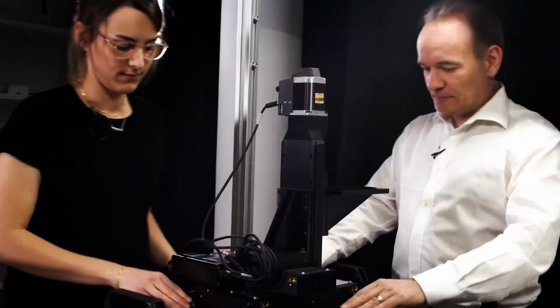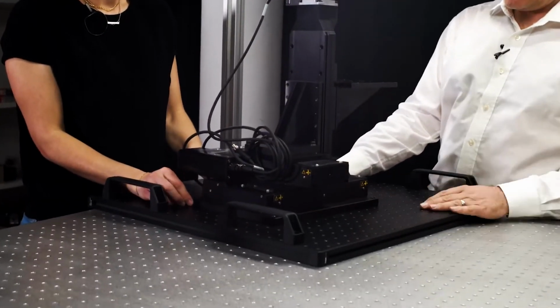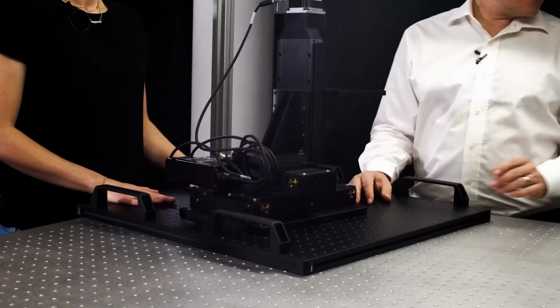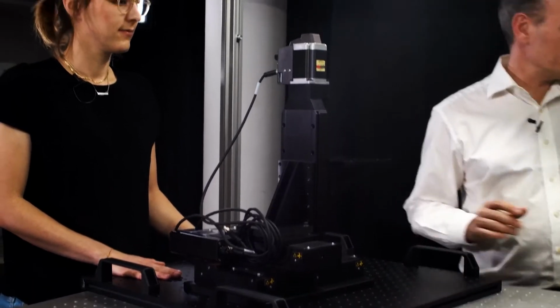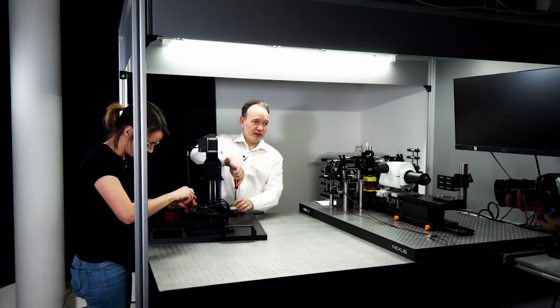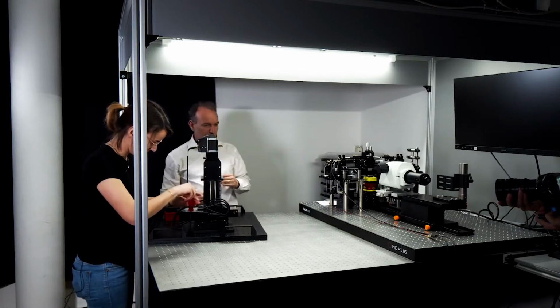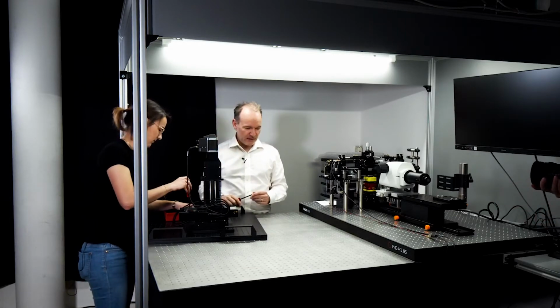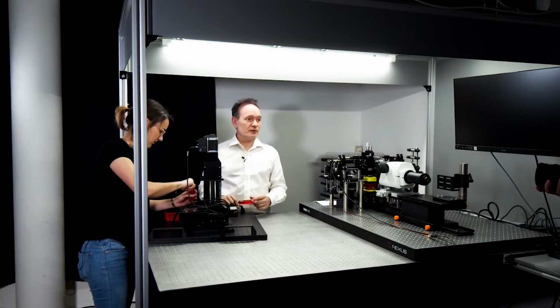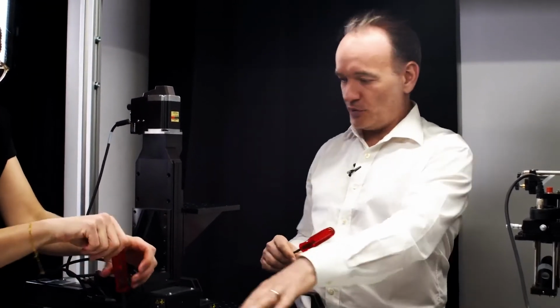So we have here an adapter plate that makes the Zebra stages easily fit to the breadboard. And we're going to fix it with M6 screws. So they are right over here. Depending on your environment, we recommend that you have some stabilization of your breadboard. Later on, you will see we're going to use some cushions, which are about that size. We're going to put them in all four corners. And so the breadboard is mechanically decoupled a little bit from the environment.